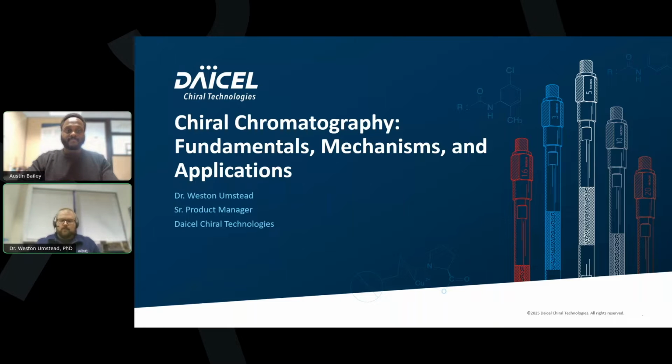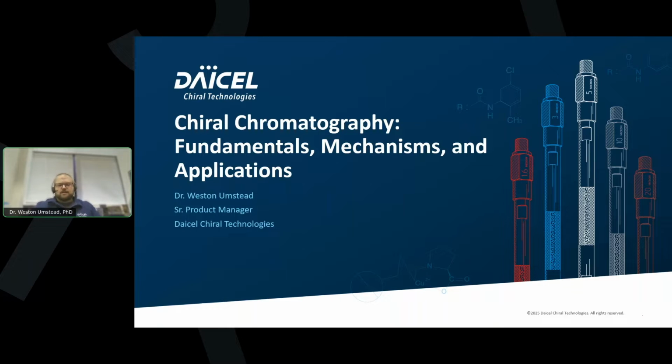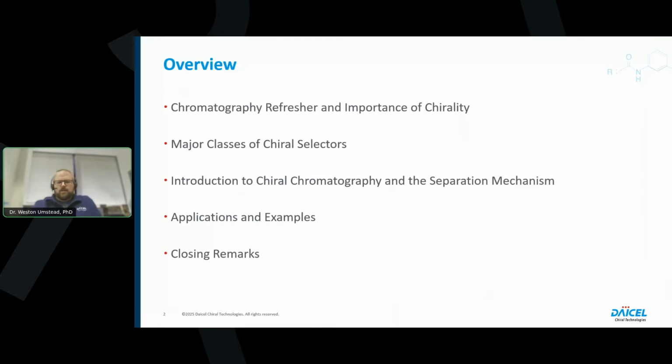And again, thank you to everyone for joining this morning, this afternoon, this evening, wherever you're located. The focus of the conversation today is going to be on chiral chromatography. We're going to do a little bit of a deep dive into some of the fundamentals and the mechanisms. We're going to start with a refresher. We want to make sure everyone is familiar with chromatographic terms before we really launch into a deep dive and discussion on chiral chromatography specifically.